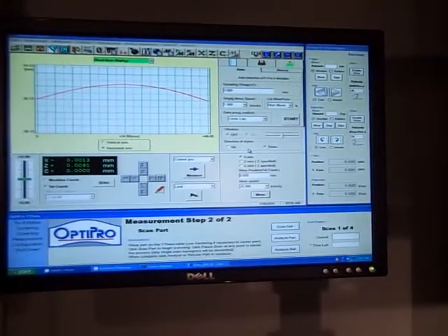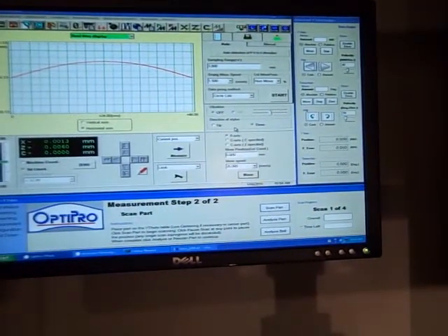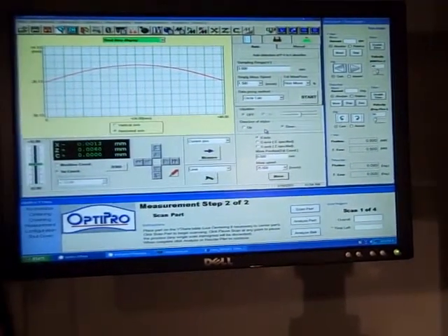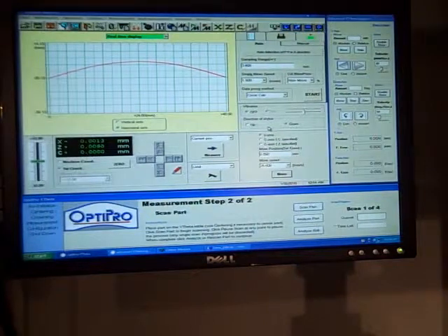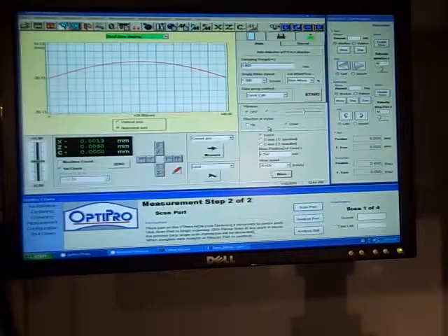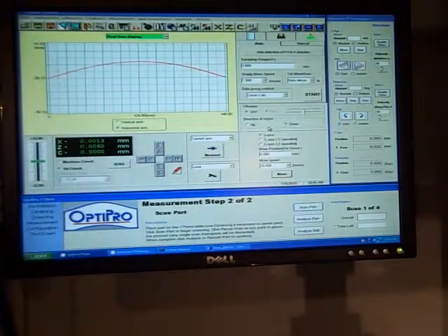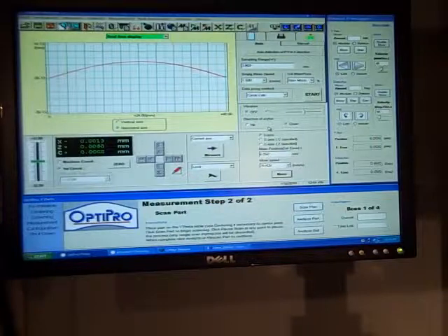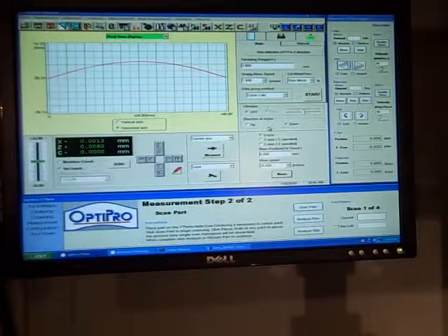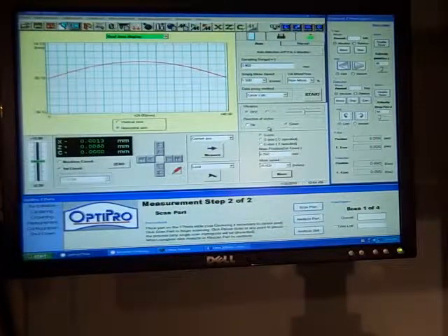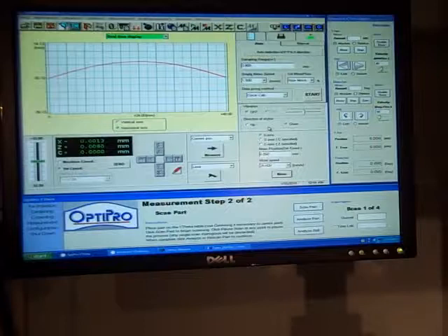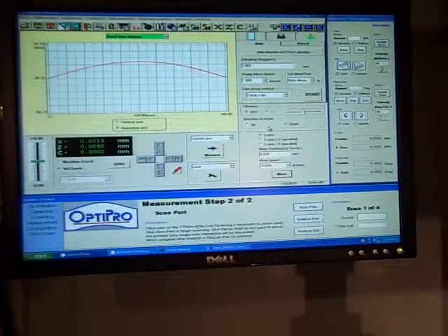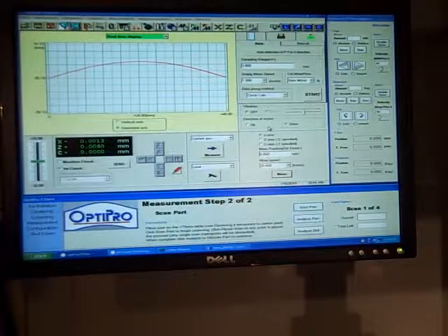The software interface controls the Zeiss Surfcom 5000 as well as the Y-theta interface. OptiPro is in development of a simplified user interface which will incorporate the Surfcom 5000, the Y-theta, and our A-spheric analysis tool.